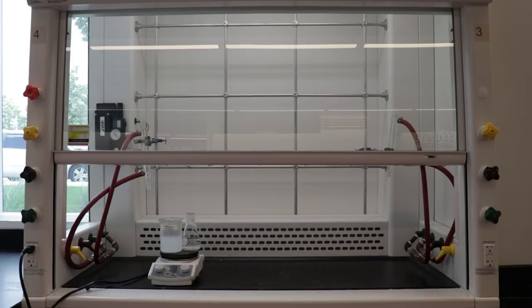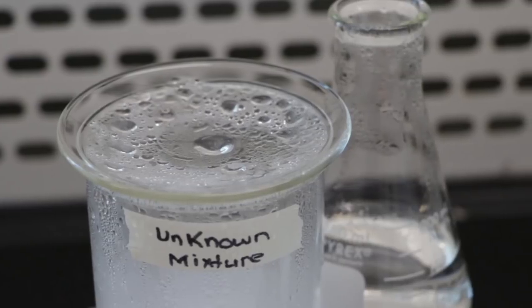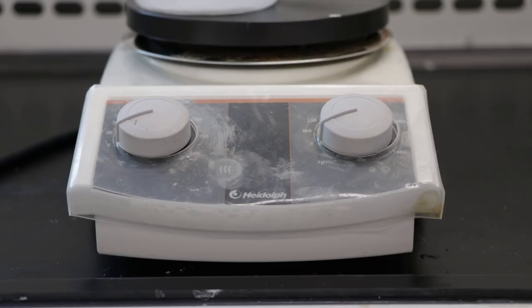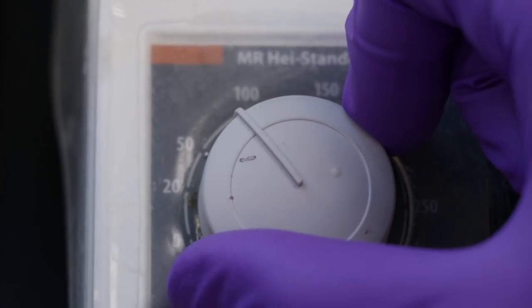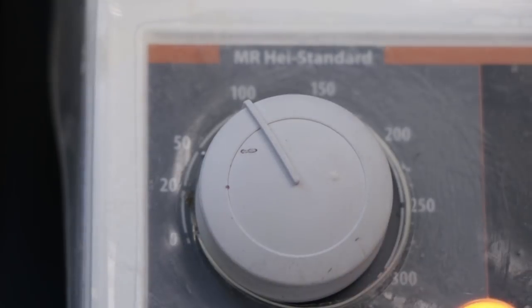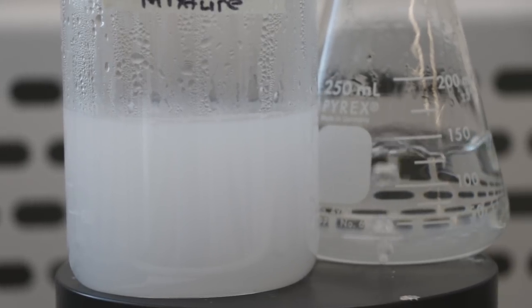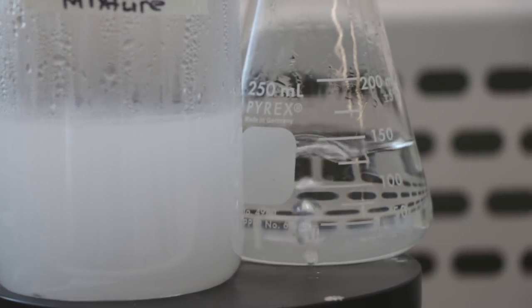Moving over into the fume hood, make sure the beaker is covered with the watch glass. Turn on the hot plate and set the dial to 90 degrees. Heat the solution and 150 milliliters of distilled water in a 250 milliliter Erlenmeyer flask for 30 minutes.